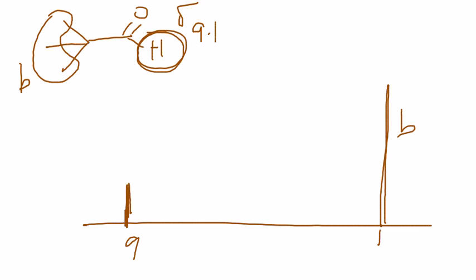And that's all that you will see. Okay, so we basically went over 2 things. One, you can look at the number of chemical environments in the molecule, and corresponding to that, you will have the same number of peaks on your NMR spectrum. And if you integrate the area under that peak, essentially that will give you the number of such protons. So for example, in this case, they are going to be in the ratio 1:9.